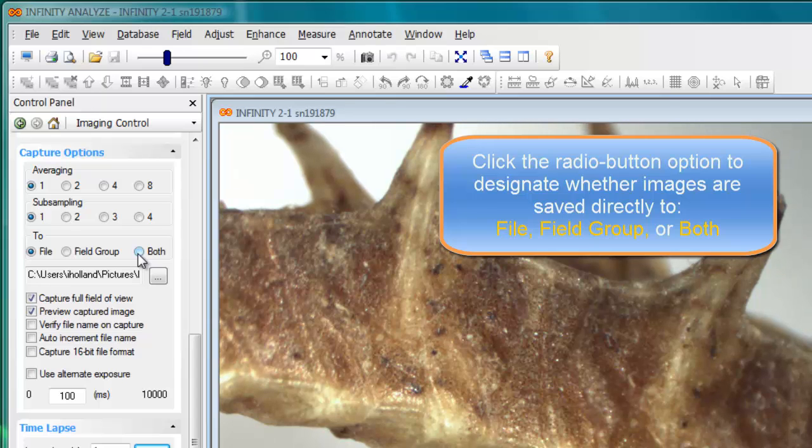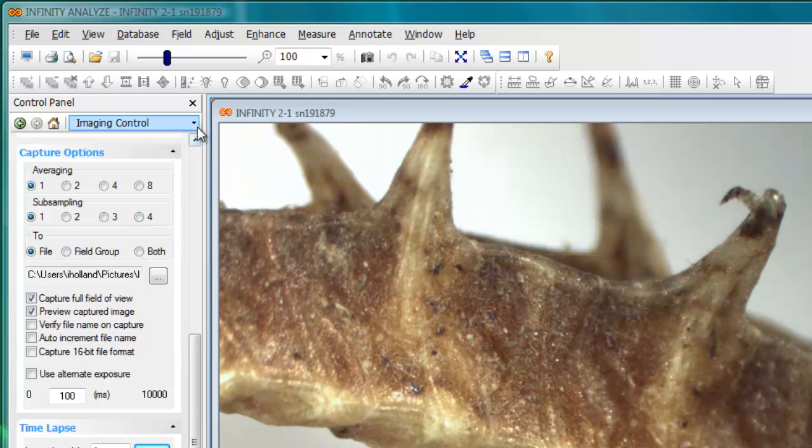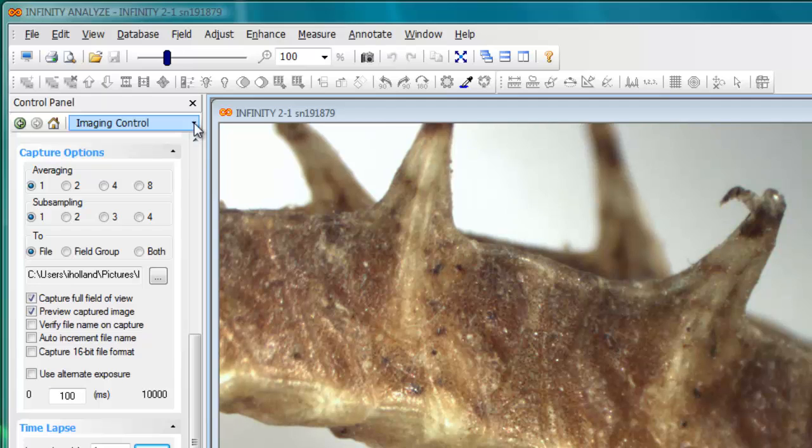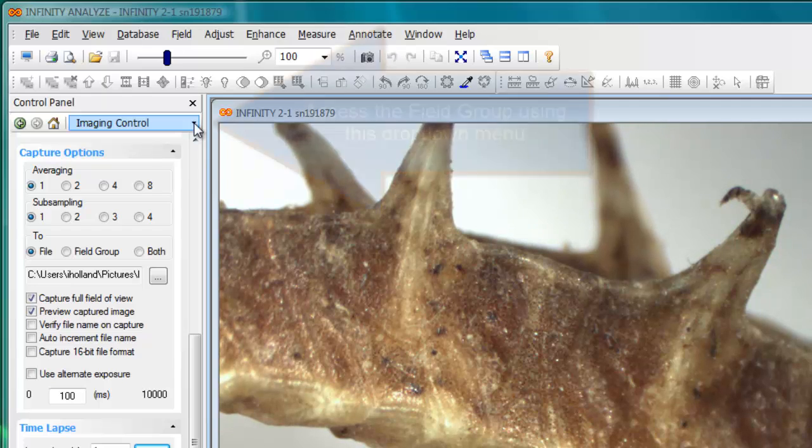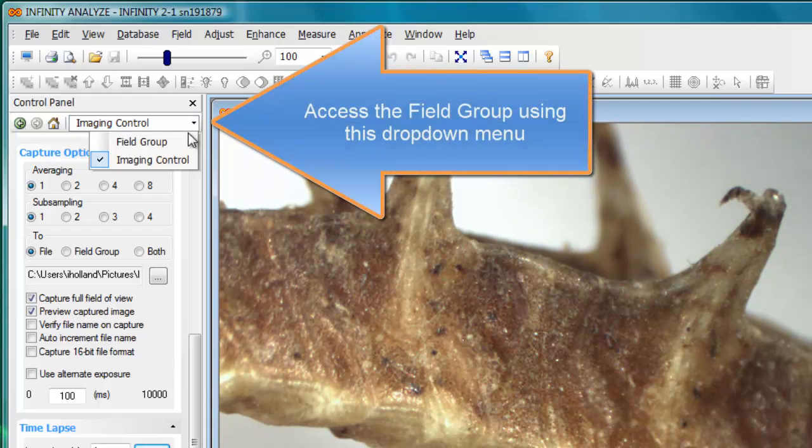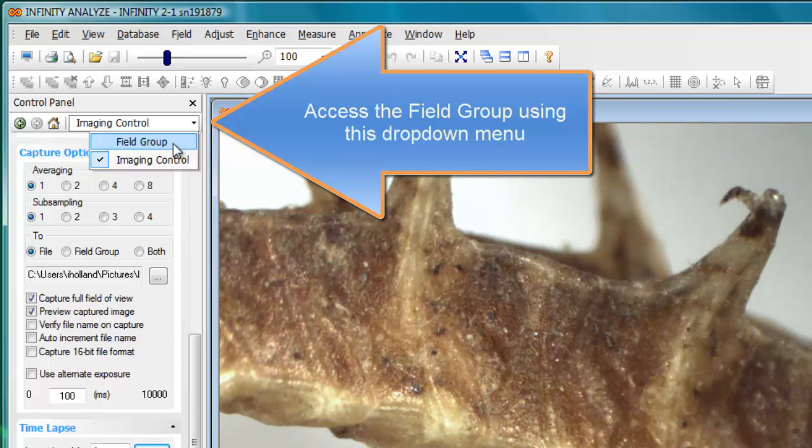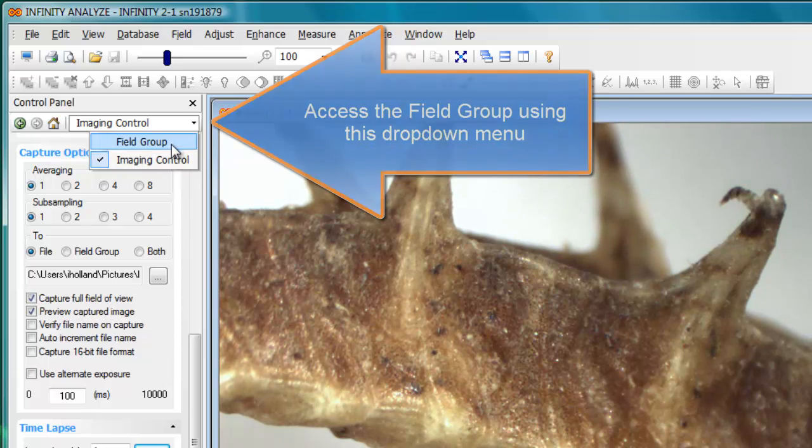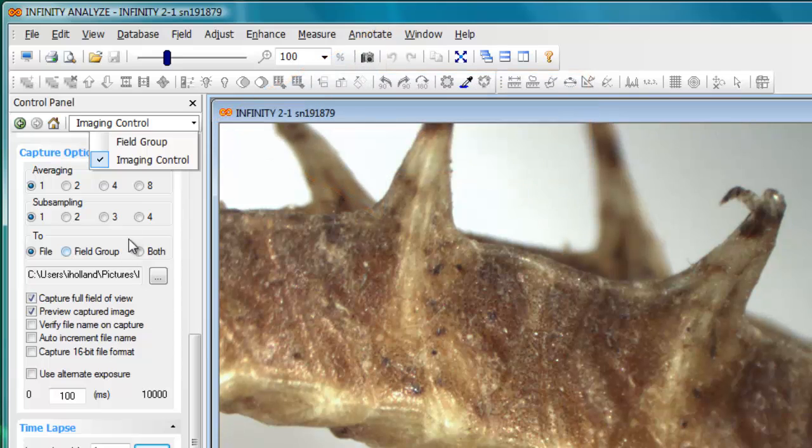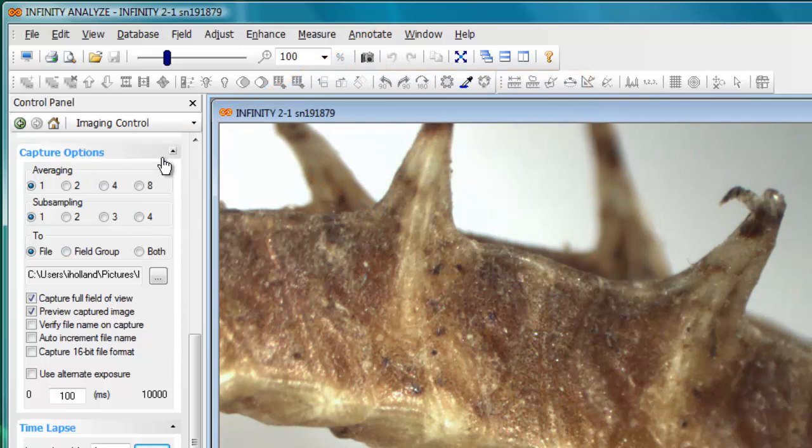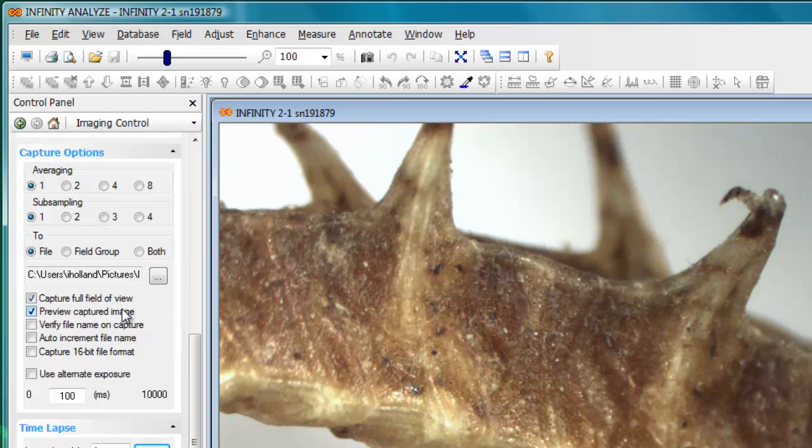As we've covered in other videos, the field group is an in-memory holding place for images that you've captured and is accessed through this imaging control and field group option dropdown. Images need to be stored in the field group if you want to combine them or process them with some of the image processing functions.